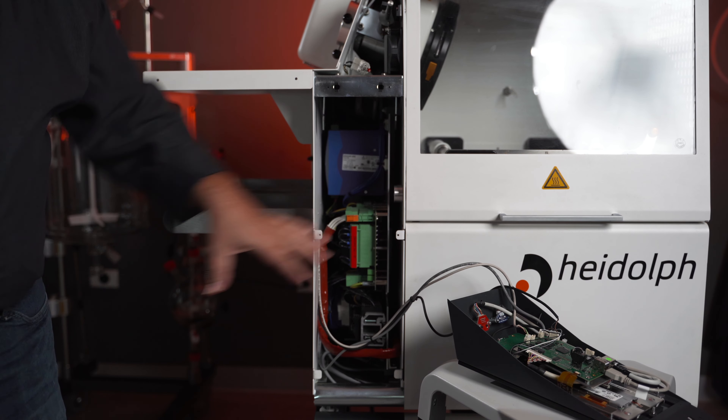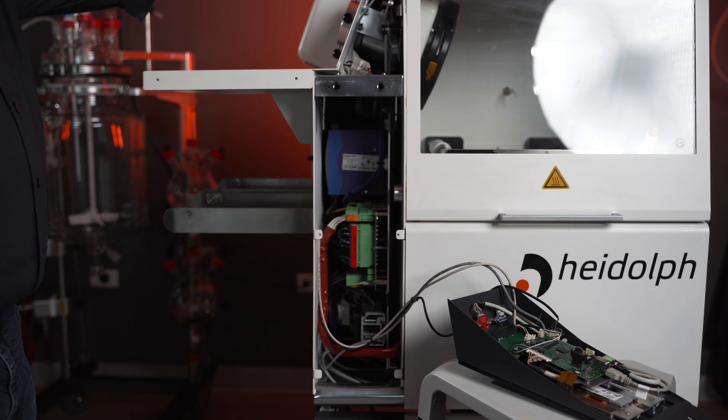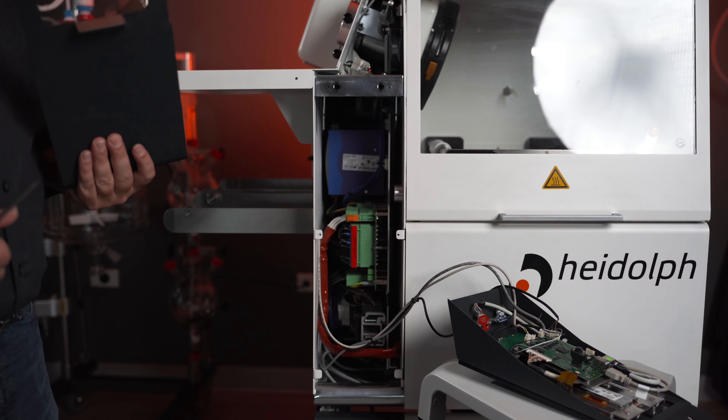At this point we have our electronics panel exposed, but we are going to be removing the rest of the side panel here to make access to the electrical components a lot easier.